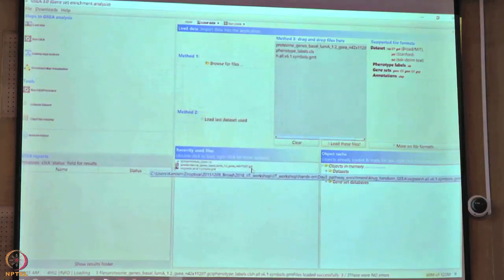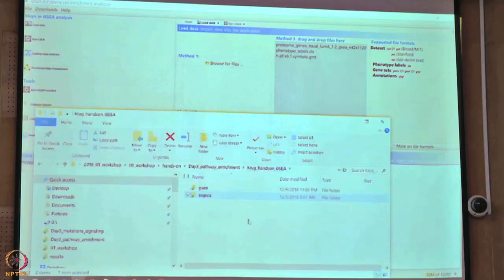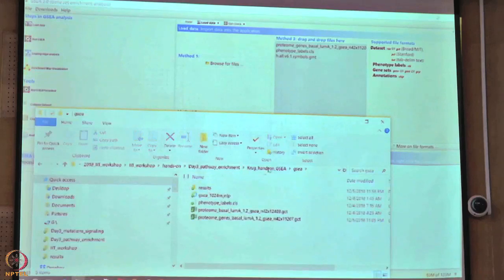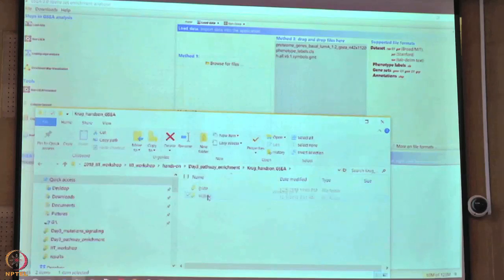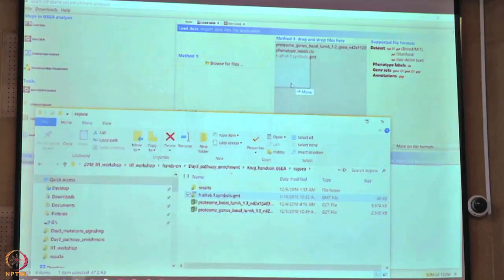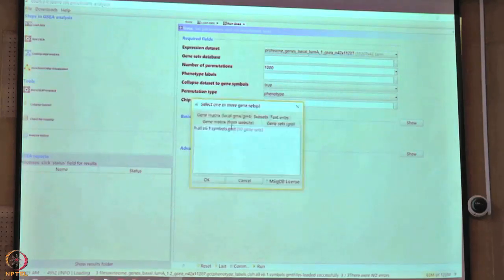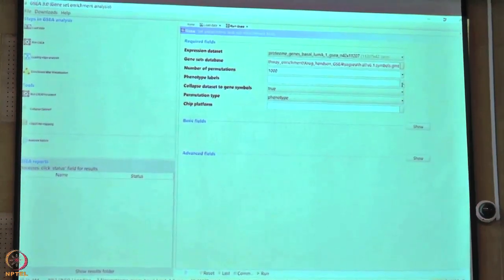We need to import the hallmark database first. Go back to Load Data, go to the single-sample GSEA folder, find the file h.all version 6.1 — that is the hallmark database — and drag and drop it into GSEA. Then go back to 1GSEA and you should now be able to see that database available. Set the number of permutations, then load the phenotype labels.